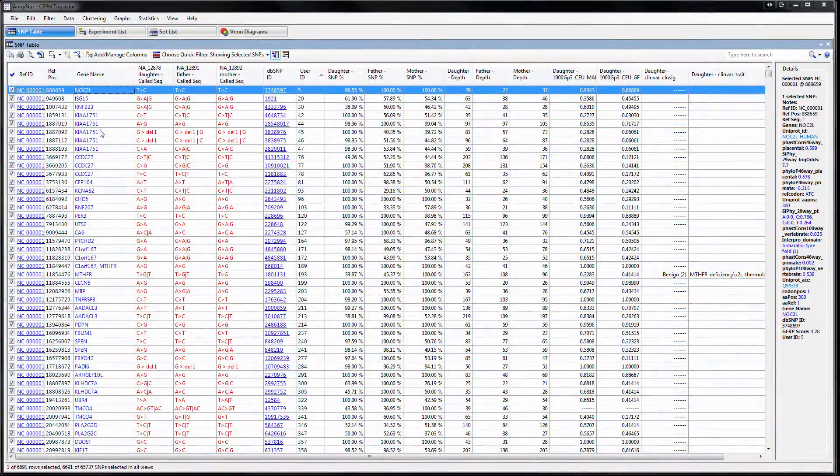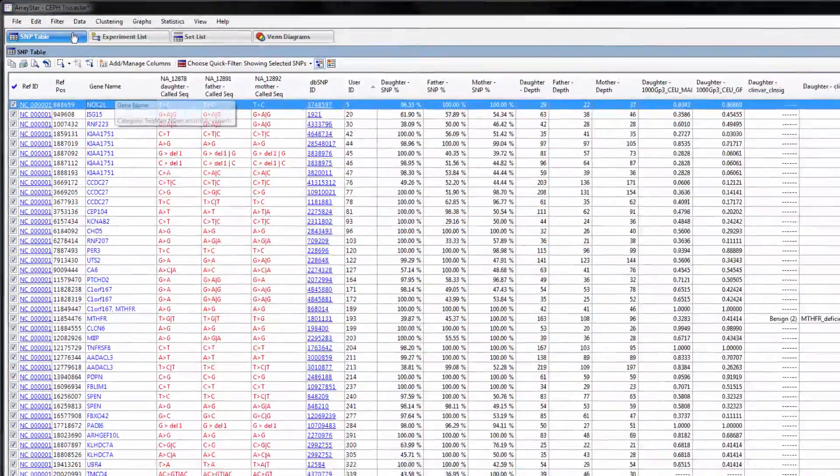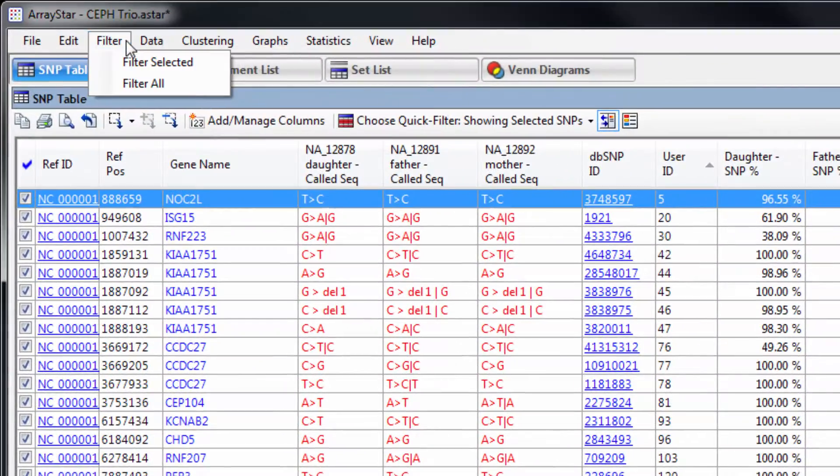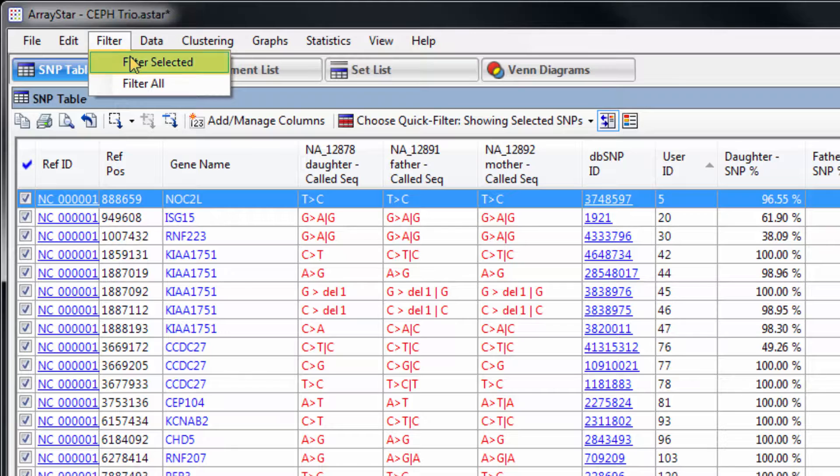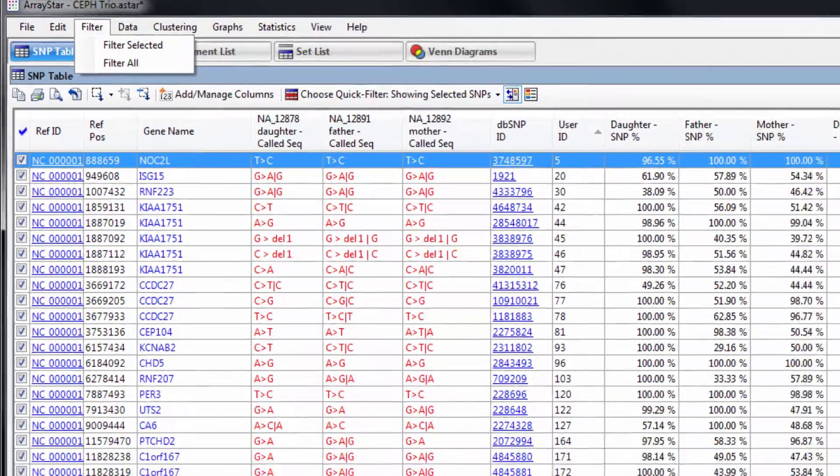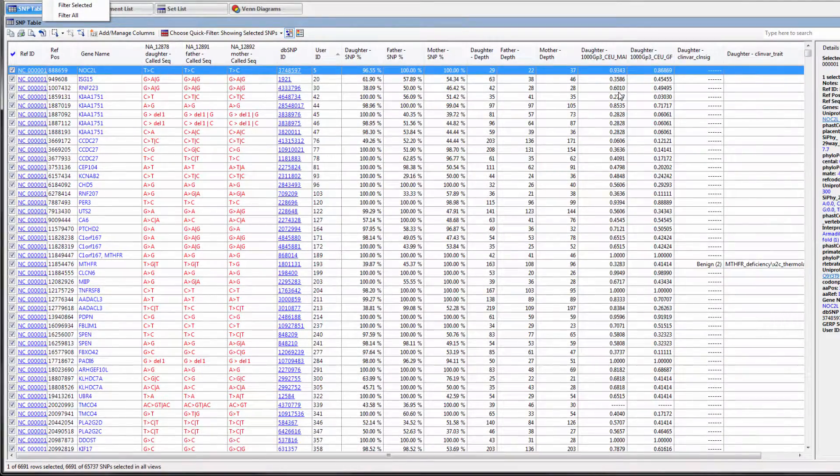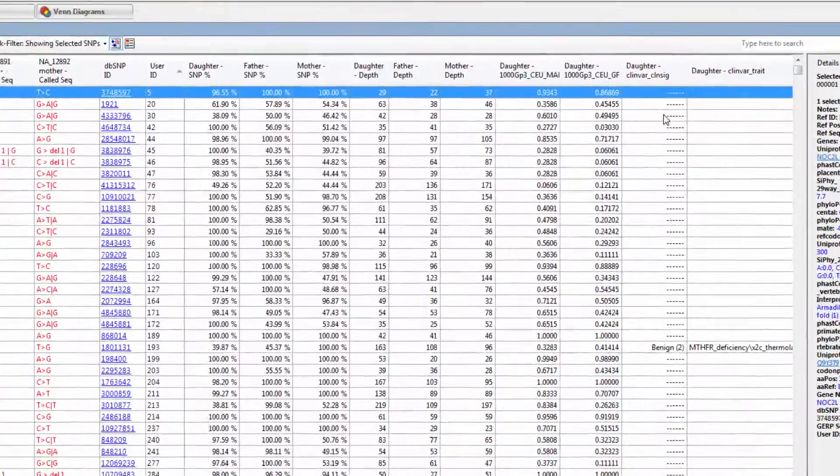At this point, you can further narrow down your SNP set using the Filter, Filter Selected menu option and search on additional statistical or annotation criteria. Or you can just browse this table for interesting information.